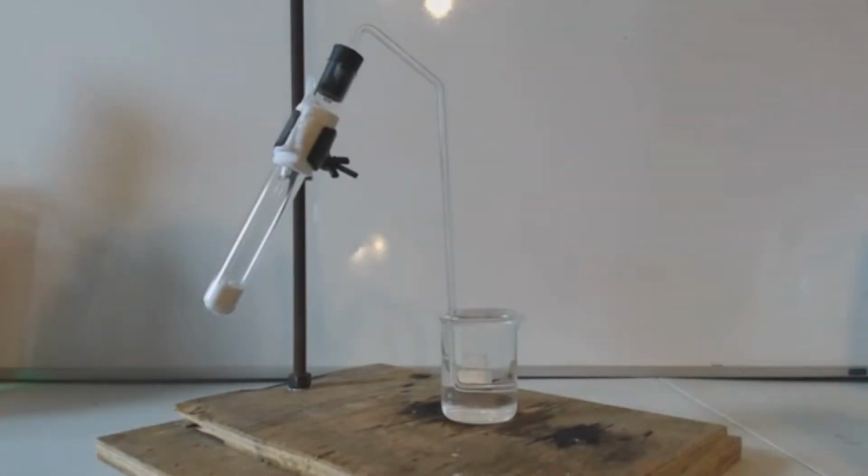But calcium carbonate is not very soluble. So when I bubble the CO2 through it, you'll actually see the precipitate coming out, so you can see what I'm talking about. And the formation of calcium carbonate will come about. I want you to think about what I'm doing here. I'm just bubbling in carbon dioxide.